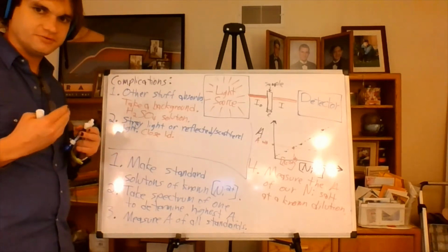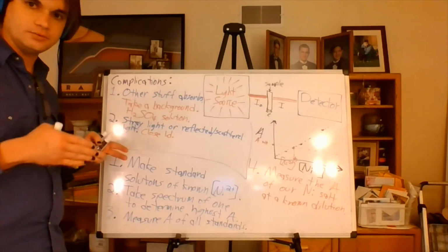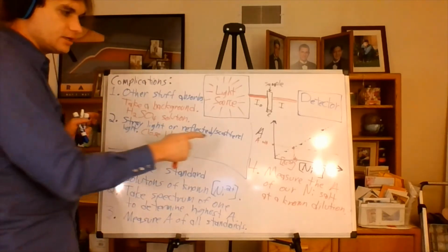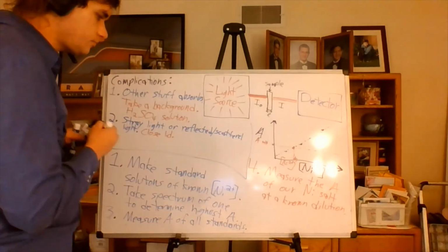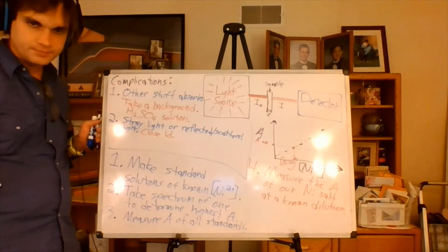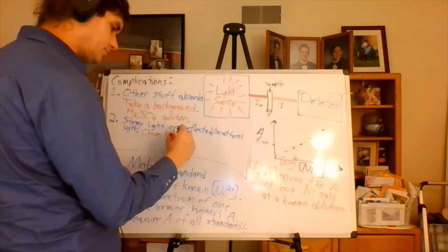And if that surface is maybe opaque or not completely transparent, or if it is irregularly shaped, some of it might actually be scattered in many different directions. So what we do to account for that is that we don't worry about it. No, I'm kidding.